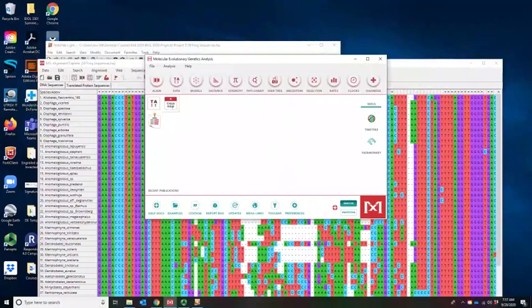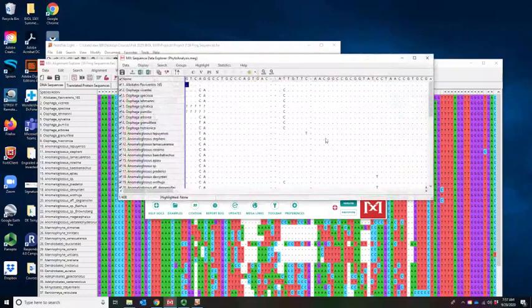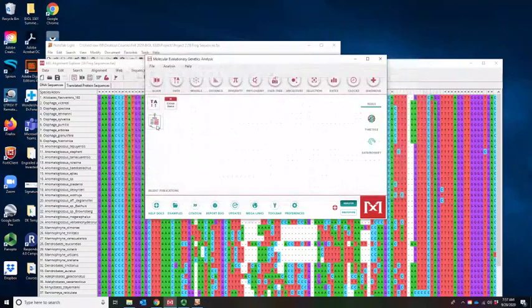And what you will notice if you look back at your main window now is we now have an extra little item here, which is our data set. And if I hit it, it's going to close it, and then we could open a new one. So we don't want to do that right now, but that means we have our data set loaded. We can look at it in a different format, which is kind of a simplified alignment format. But again, that's not as important for us right now. So right now we have our alignment, and we've got our main window.